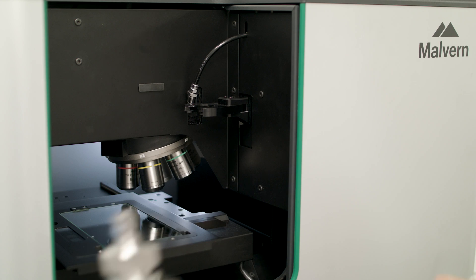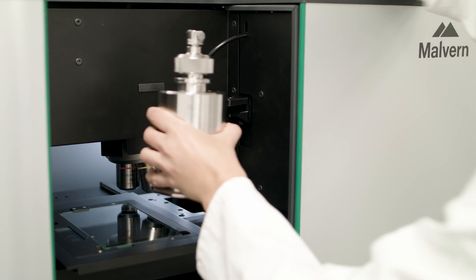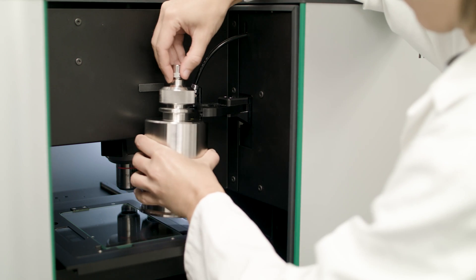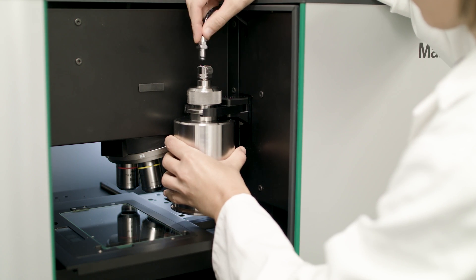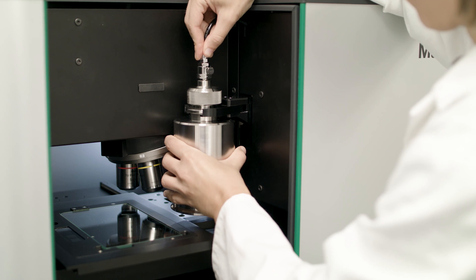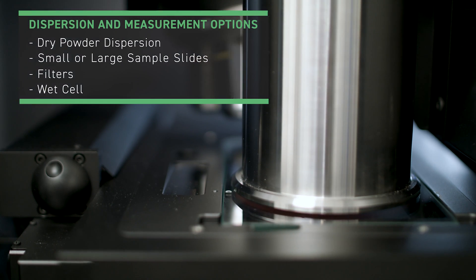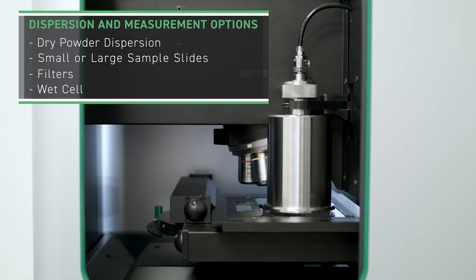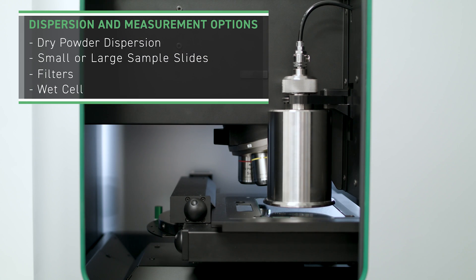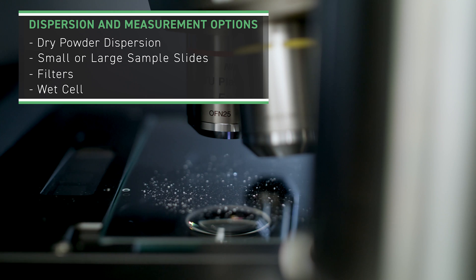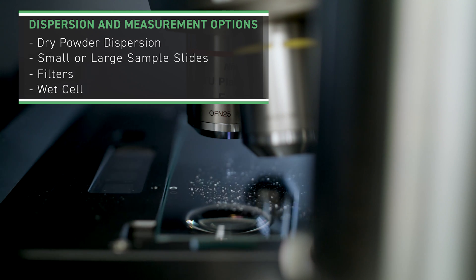This too can be fully automated into the SOP, providing one-click measurements, freeing up valuable time for busy analysts. Other types of sample holders are available for suspensions and filters.